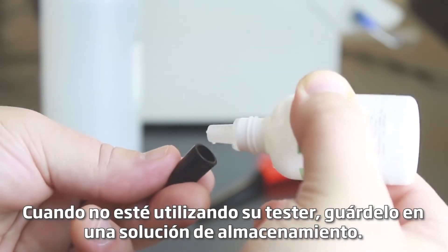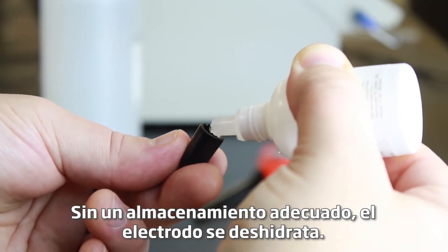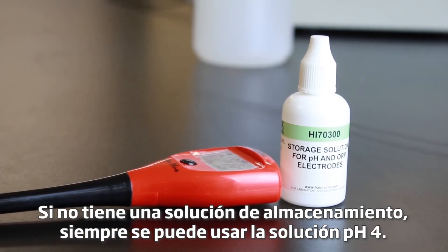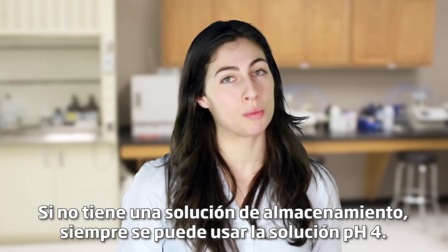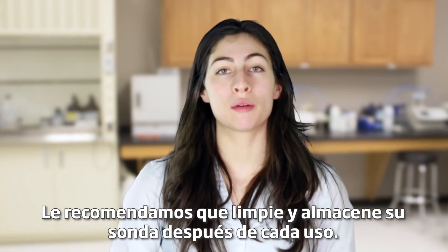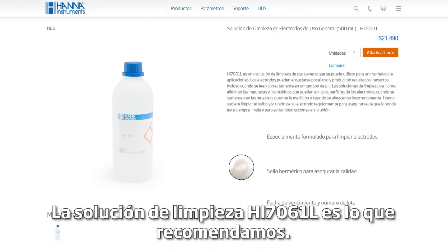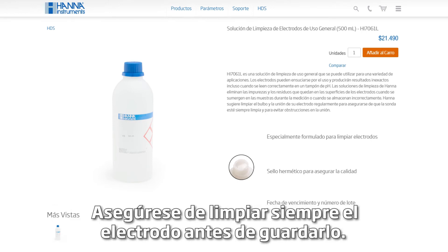When you're not using your tester, keep it in storage solution. Without proper storage, the electrode gets dehydrated. If you don't have storage solution, you can always use pH 4 buffer too. We recommend you clean and store your probe after each use. The HI-7061 cleaning solution is what we recommend. Be sure to always clean the electrode before you store it away.